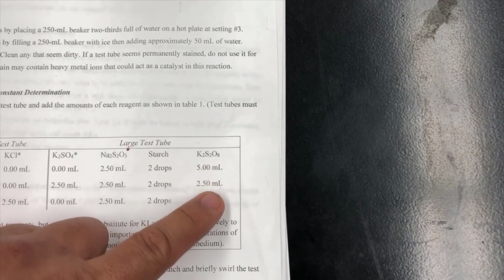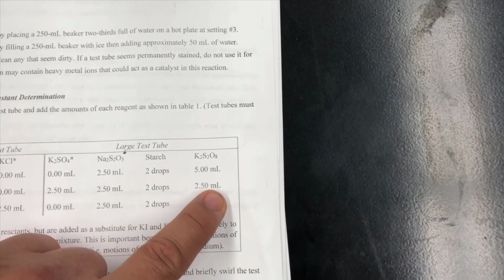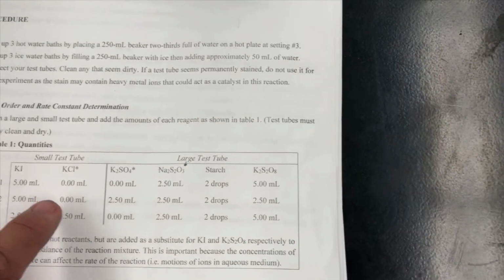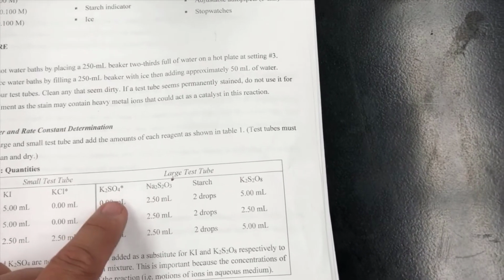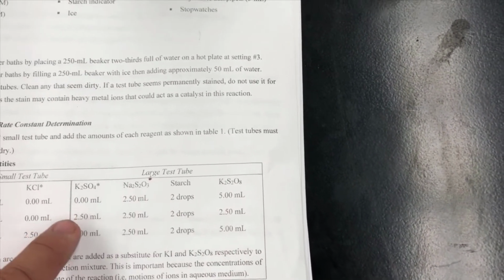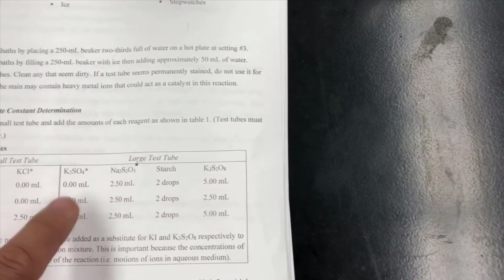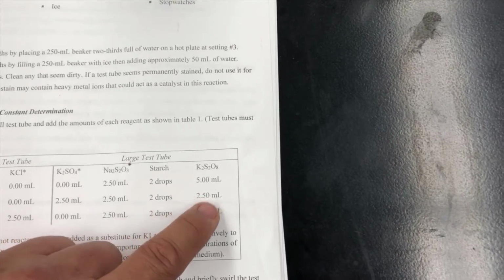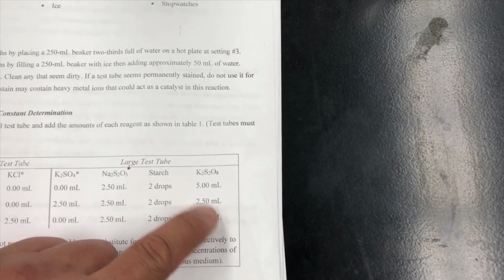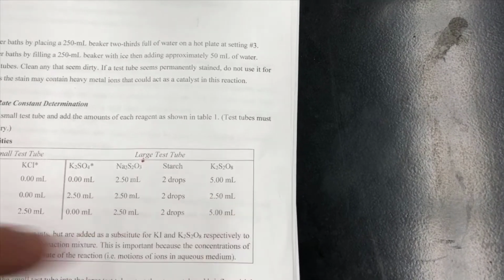You'll notice it went from 5 to 2.5. So now if you take this total volume on this side, it's 7.5 mils, ignoring the drop, just as it was in trial 1. So we're trying to keep the total volume the same, but adding this to substitute for this. Now this doesn't do anything, so this concentration in the final solution is essentially 1/2 of its original concentration.